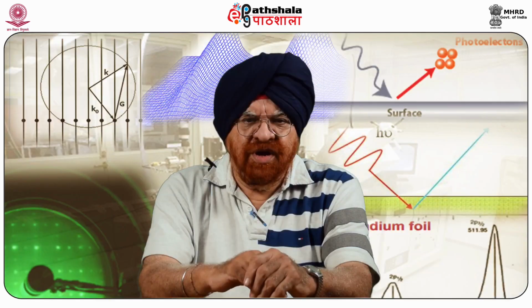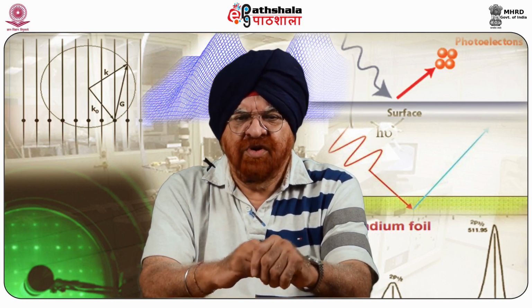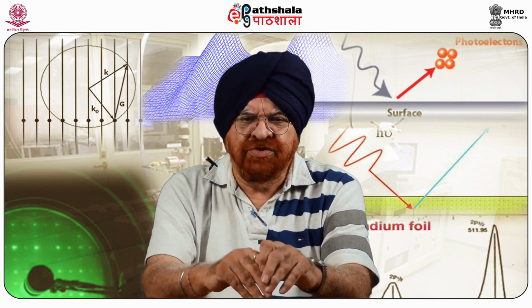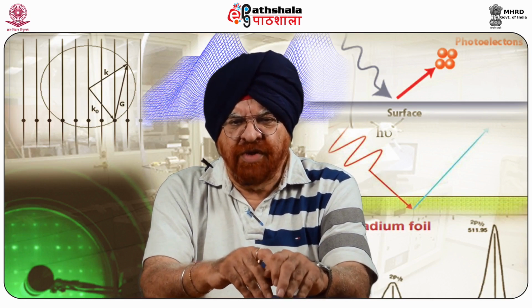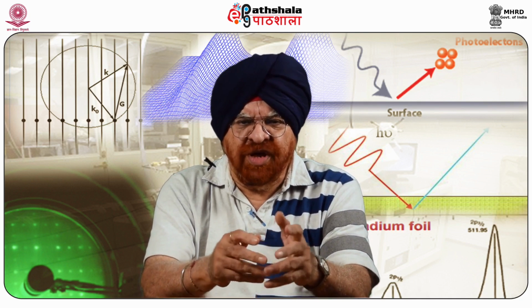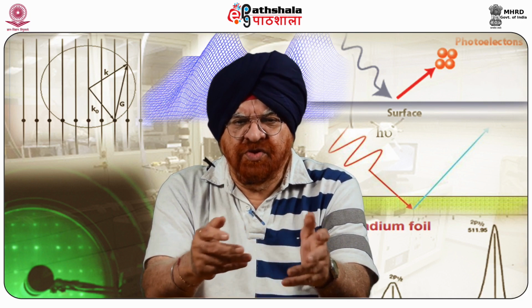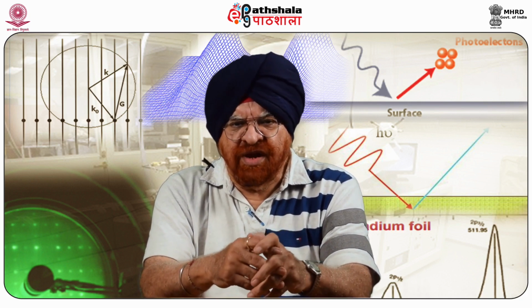We'll soon show you the schematic diagram of Kelvin force modulated microscopy, or Kelvin probe force microscopy as we have been calling it. The experimental apparatus which is used is shown in the next slide.